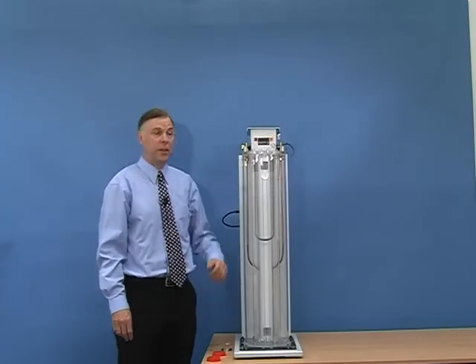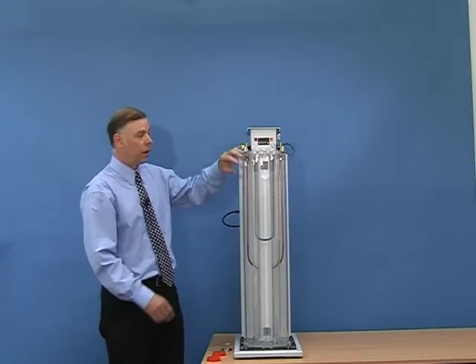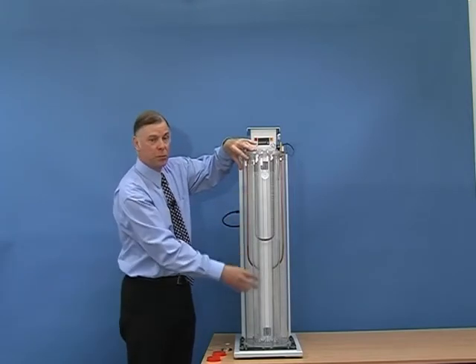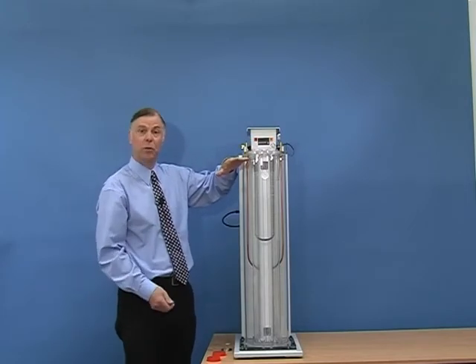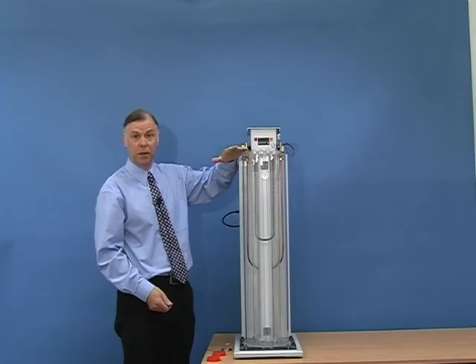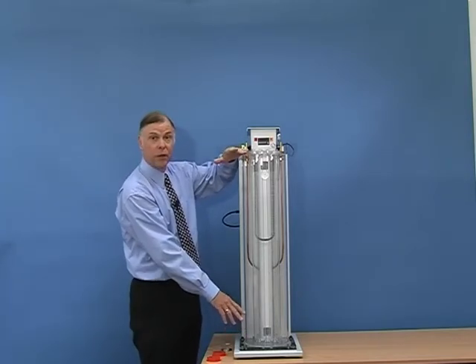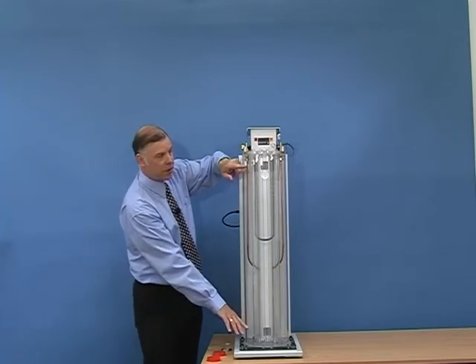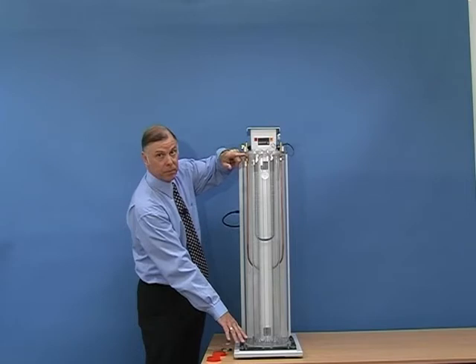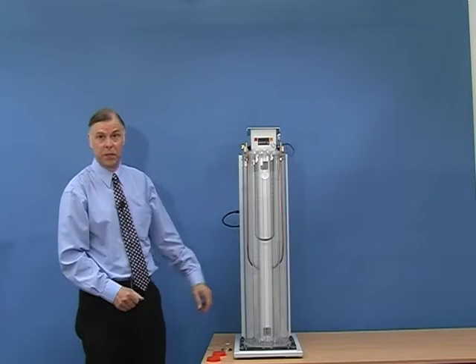Typical life of a density gradient tube is about 6 weeks. What will happen is the liquids will very slowly mix together, so the low density — which we said was 0.9 — will gradually increase to say 0.91, and the higher density of 0.95 will gradually reduce to 0.94, so the two outer floats will start to reach the edges. When the floats reach the top or the bottom of the tube, then you have to replace the liquids.